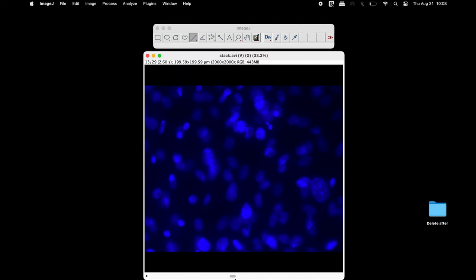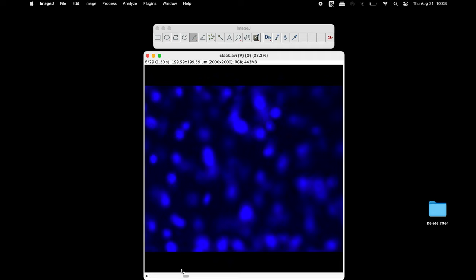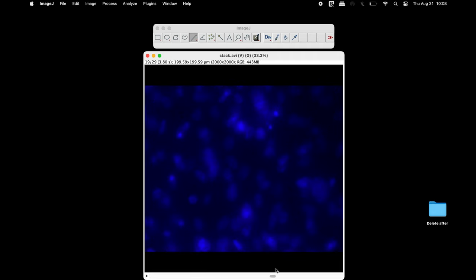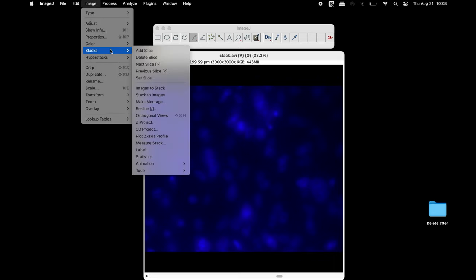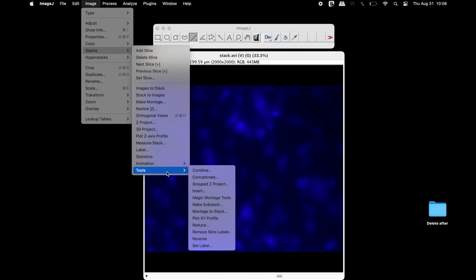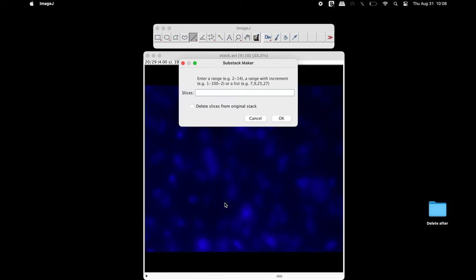Quantitation of the area and mean intensity can be performed for the entire 29 slices or only a few slices can be selected. To select only the slices of interest, click on Image, Stacks, Tools and select Make Substack.